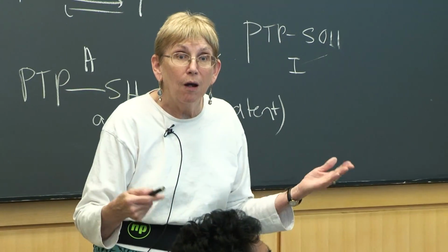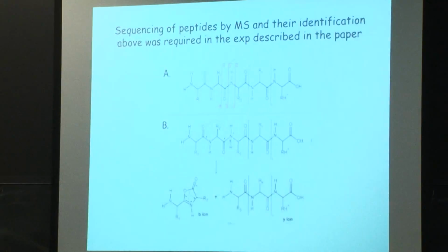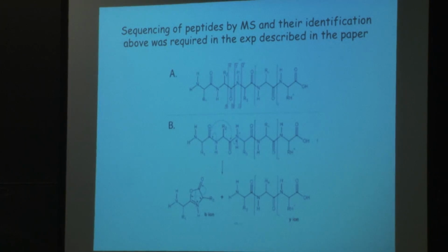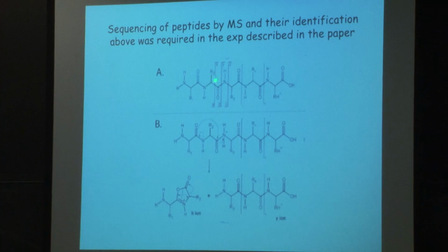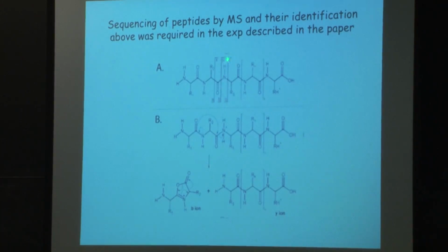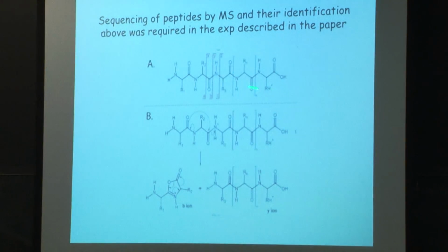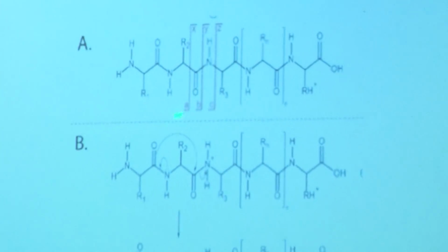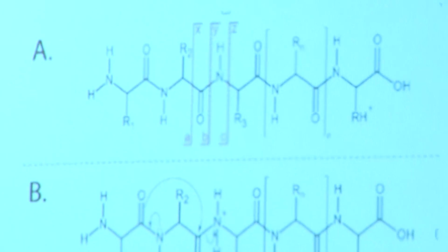Depends on the stability and the fragmentation patterns, but we know peptide bonds can fragment in a number of ways, and people have figured this out over the years, namely Klaus Biemann figured this out, that we have B and Y. One reports on the C terminus of the peptide, the other on the N terminus. Those are the fragmentation patterns observed most frequently.